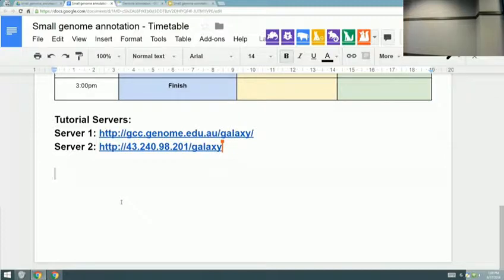No, you don't have to. That's just for labeling mostly. It potentially could be used, but I sometimes have some databases with genus specific options. If you do specify it, there's an option to use the genus and then use a special transformation. Doesn't gain you much advantage.